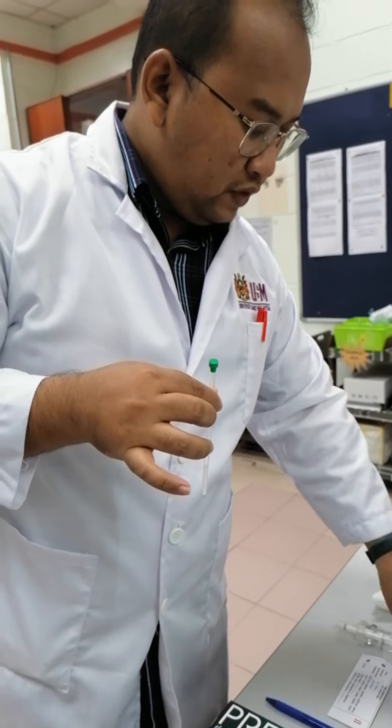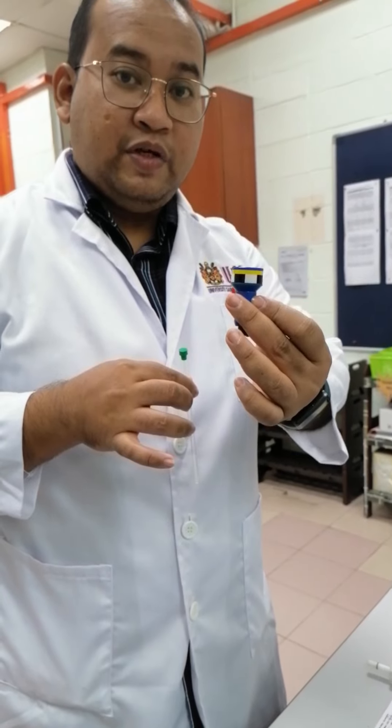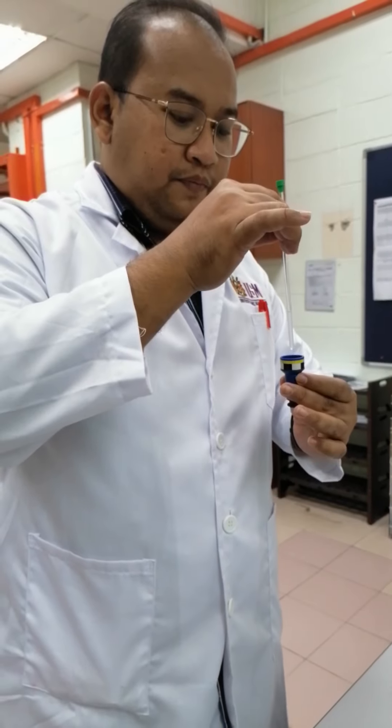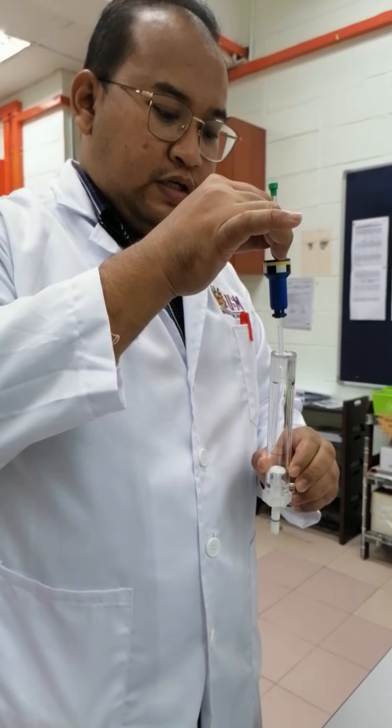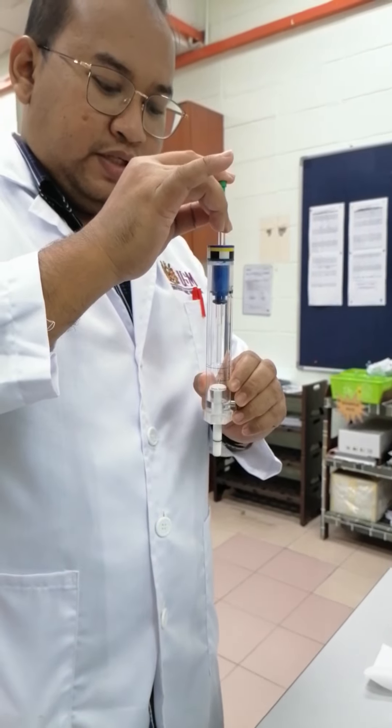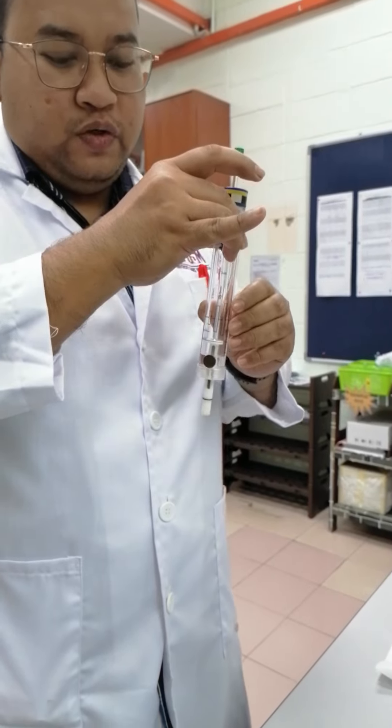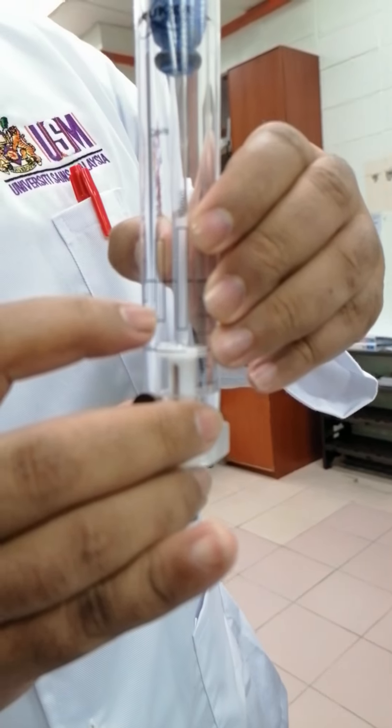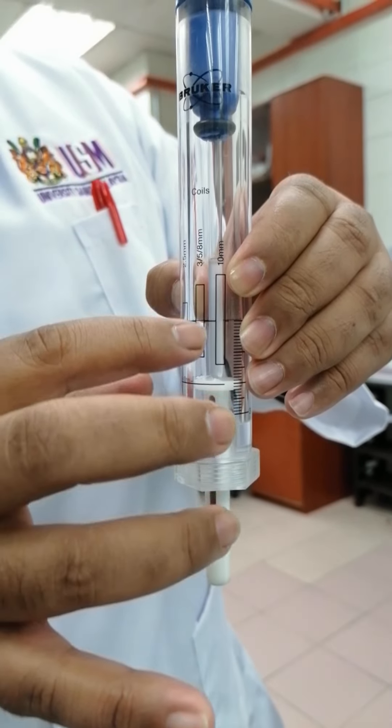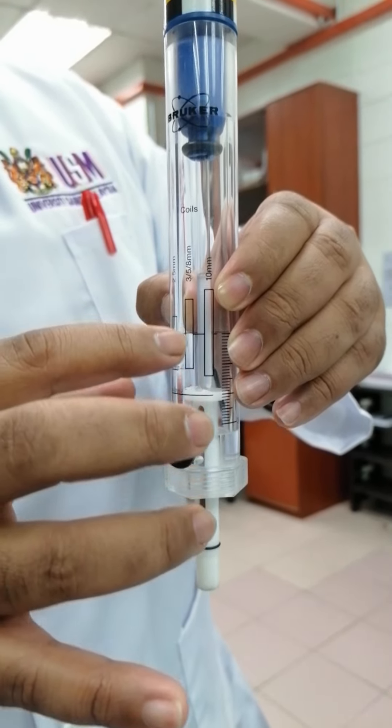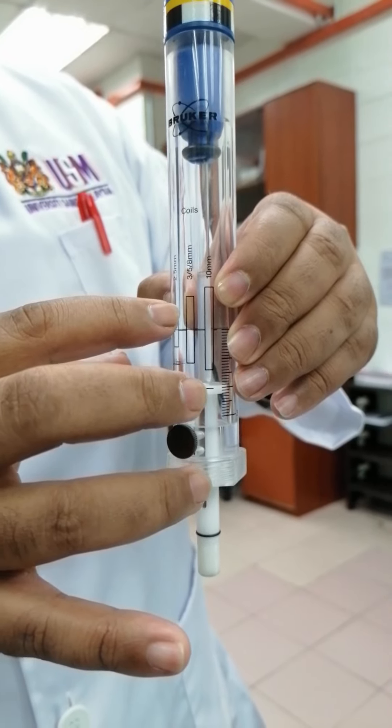And after that, we put inside the spinner. This is the spinner. And we have to use leveler to make sure we are in the product and make sure we have this length of solvents. And this is magnetic field that they will measure for our samples.